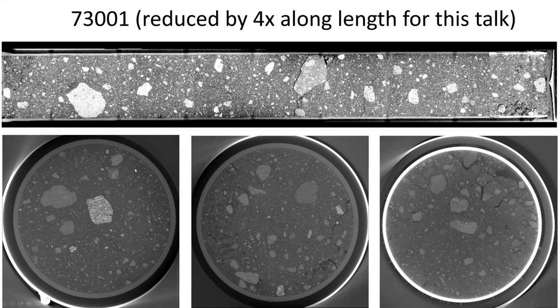But another artifact that we have is when we looked at these images of the core at the bottom, you can see that where we have the bright iron tubing, the iron outer sleeve in the image, this half of the image is bright and this part of the image is dark. And because everything was tilted, that moved.